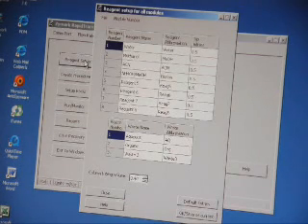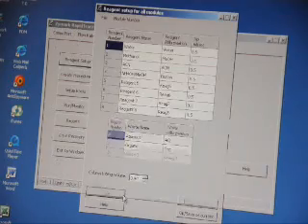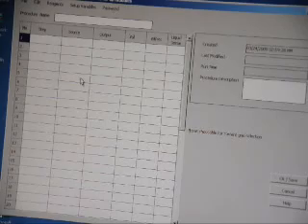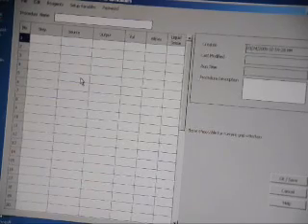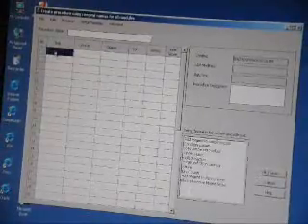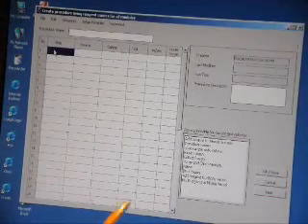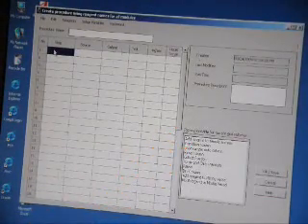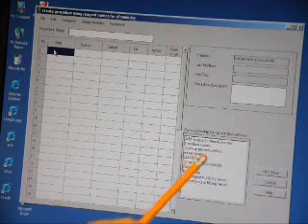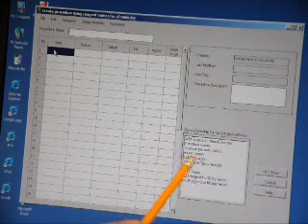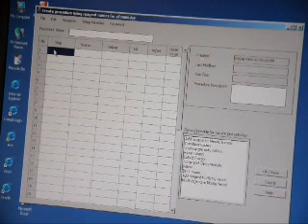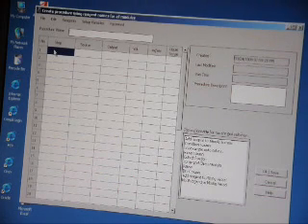I'm going to close this screen now and go into Create Procedures. In Create Procedures, typically, to make a method, I would basically ask it to do different steps. The steps are things such as condition the column, load the sample onto the column, rinse the column, or collect a fraction. There's also options for purge and clean cannulas, which allows you to wash the syringe of the system.